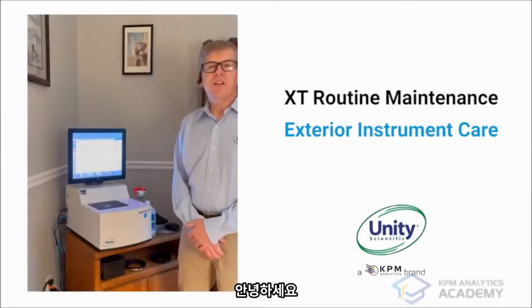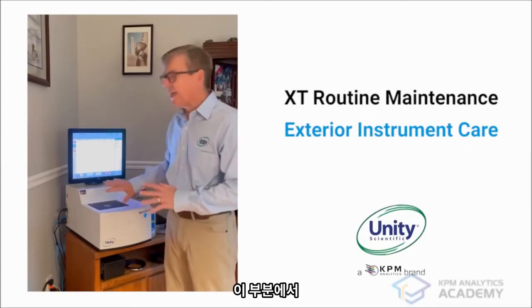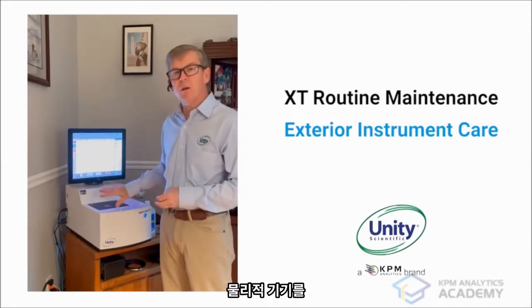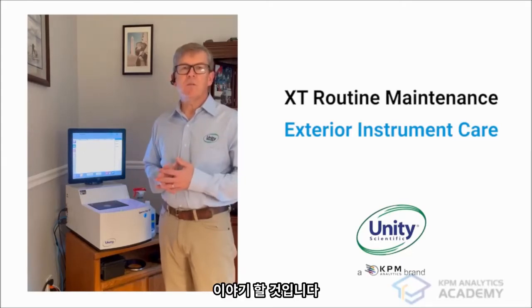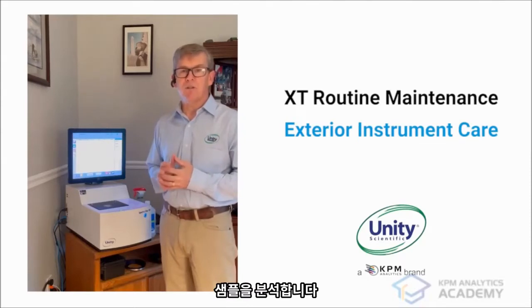Hello, in this section of the KPM Academy routine maintenance course, we're going to talk about taking care of the physical instrument, the exterior of the instrument. We're often asked, what are the maintenance requirements for taking care of the XT? Well, one of the things we did when we designed the XT is we wanted to make sure that it was stable and well protected and able to analyze samples reliably in difficult environments.